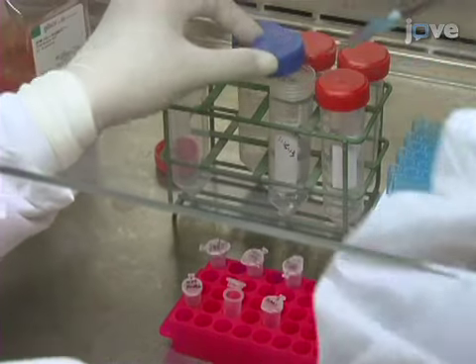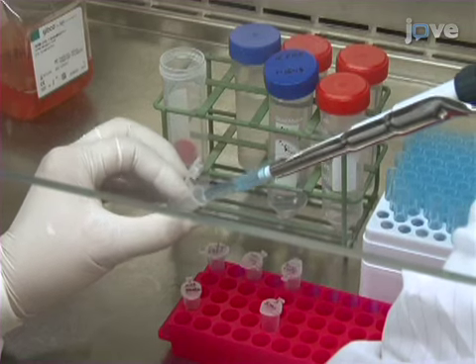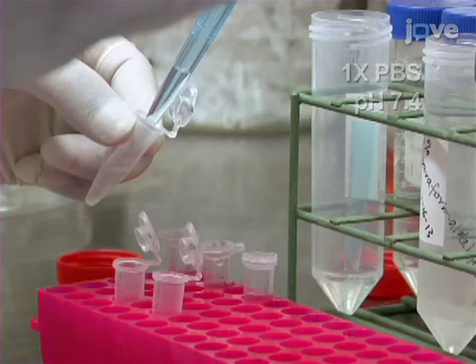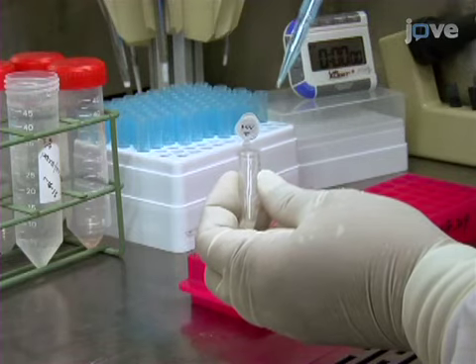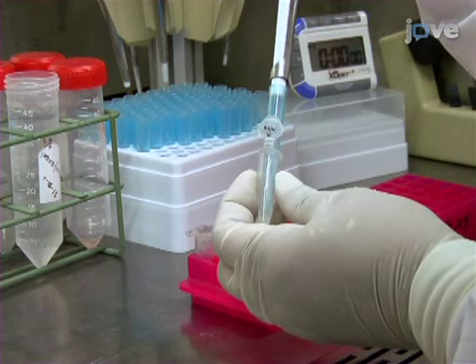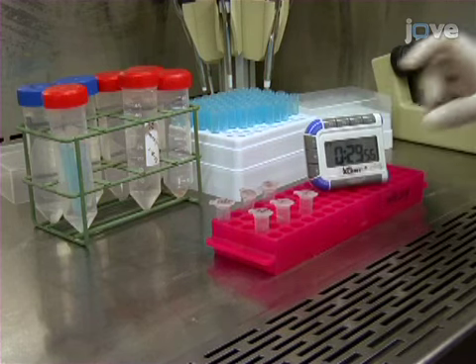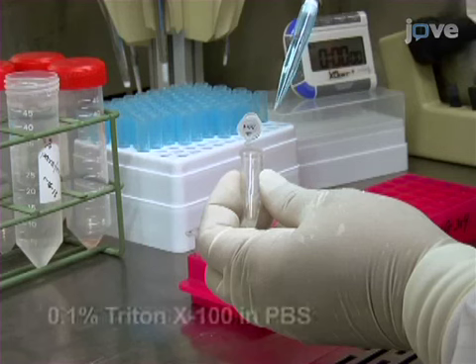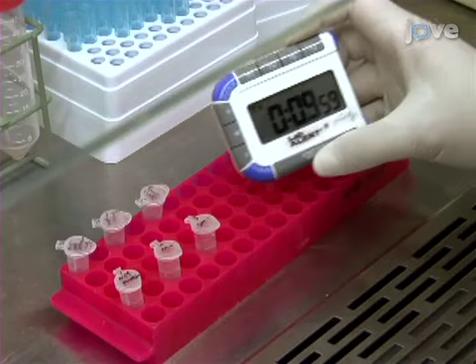Following the incubation, perform a terminal deoxynucleotidyl transferase-mediated dUTP biotin nick end labeling, or TUNEL assay, to assess apoptosis. To do this, first wash cells with PBS. Then, aspirate the PBS and add 4% paraformaldehyde in PBS. Incubate for 30 minutes at room temperature to fix the cells. After fixing the cells, wash them with PBS and add Triton X-100. Incubate for 10 minutes at room temperature to permeabilize them.